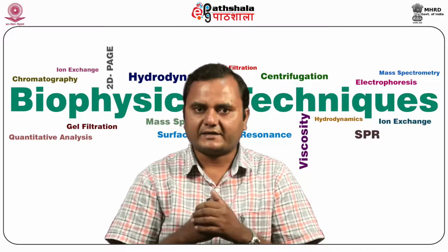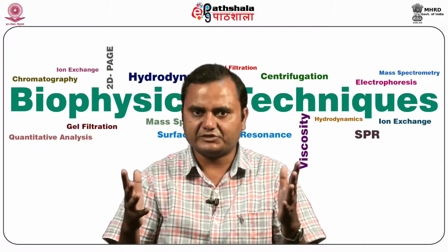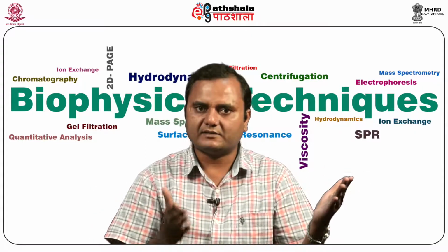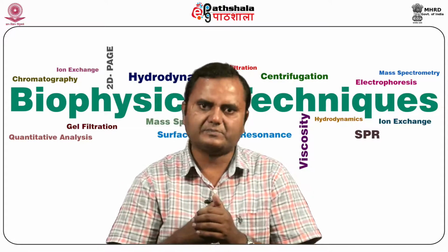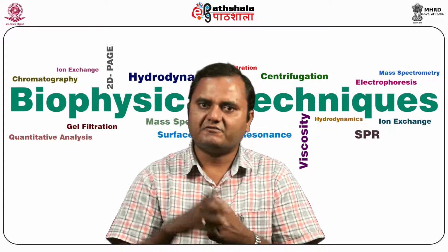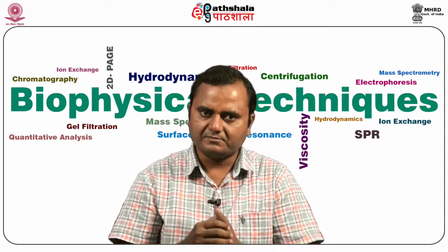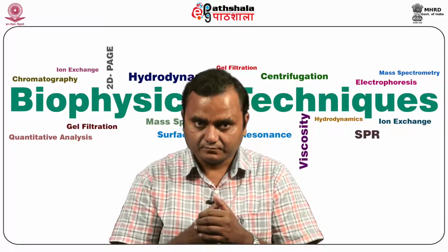It is used to characterize the solution state behavior of the molecules under various conditions, and of course it is also utilized to measure the thermodynamic properties as well as the hydrodynamic properties of the molecules in solution. So this is a widely used technology. Of course it is a very costly technology, but it is widely used for various biological purposes.